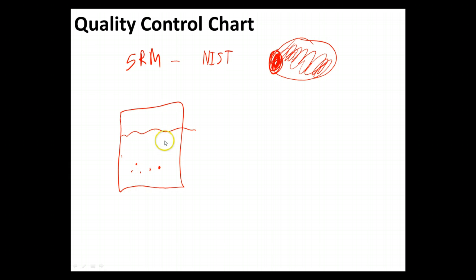Now, what we do then is we pass this basically through a small straw into a flame, a burner, and the burner acts just like a cuvette would if you set it up inside of like a Spec 20. This ends up holding our constant amount of sample with a certain path length. You pass light through here, and from the light measurement, you're actually able to determine the amount of zinc passing through at any given moment. Extra information just to give you some context for what we're talking about.